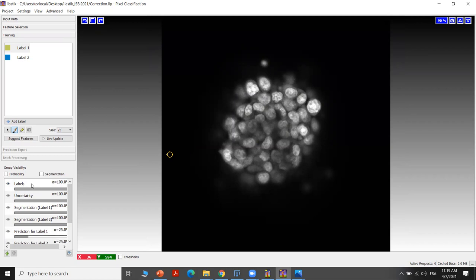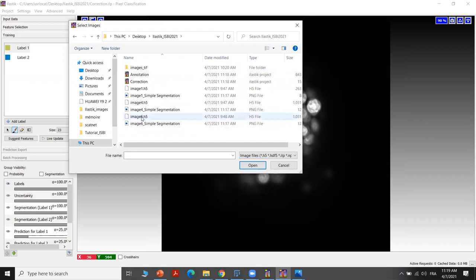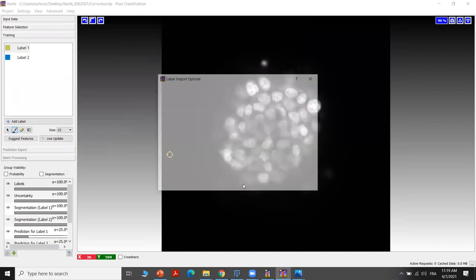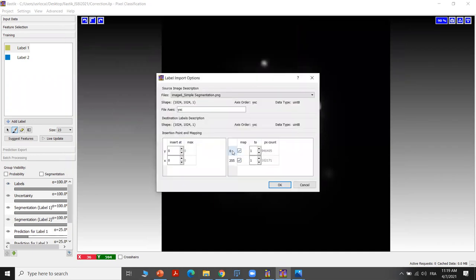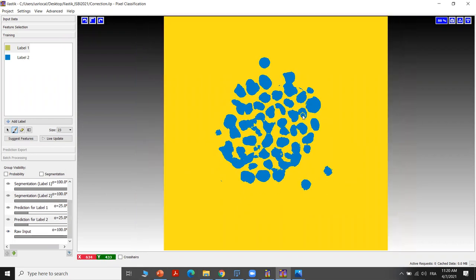So first, we have to import the labels. Here we import the labels — we already have the segmented image of image 6, the sample segmentation. We import them and then we choose, for example, that the value 0 in the segmentation map will be label 1, and the value 255 will be label 2. After importing them, we have these new labels where we can start doing the manual correction.